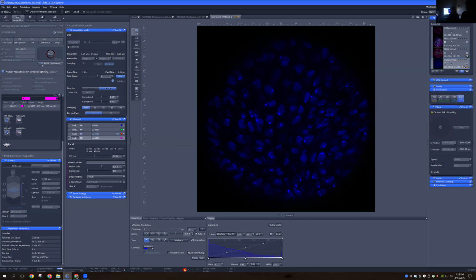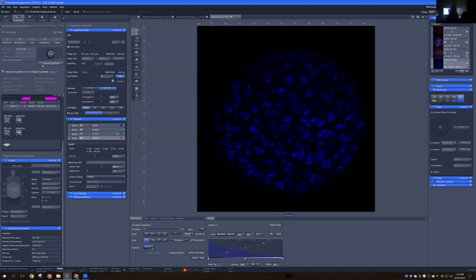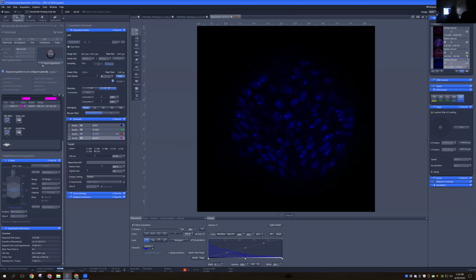And so in terms of training to use the machine, the way that my lab runs our trainings is that the first thing you do is someone operates the microscope and you sit in the corner and you watch and they explain what they're doing. And you do that for about 2 hours while you acquire some images. And then in the next session, you are the one clicking the buttons, after the person who's training you tells you what buttons to click so that you don't click anything wrong. And you do that for about 2 hours. And then in the third session, the person who's training you is the one who sits in the corner and is mostly silent while you click buttons and look to them to make sure you're not going to click a horrible button that's going to break everything.